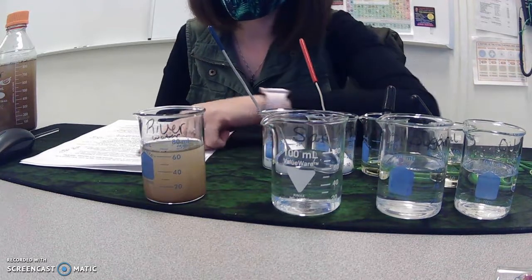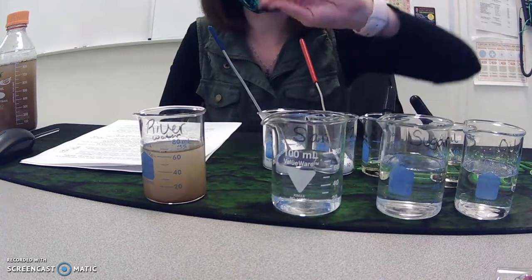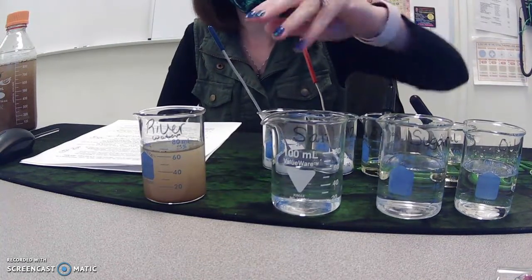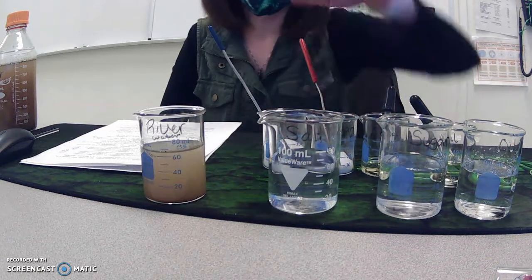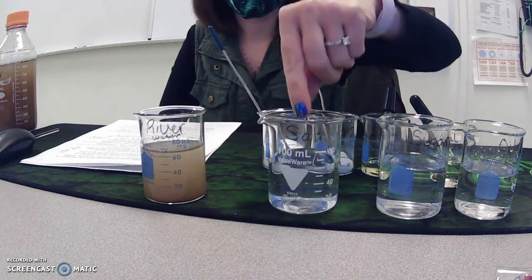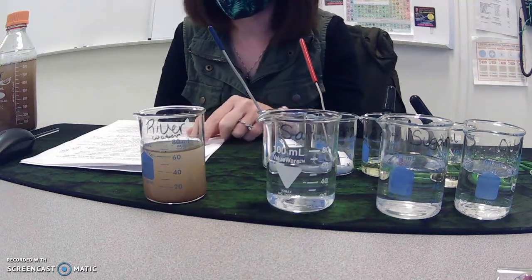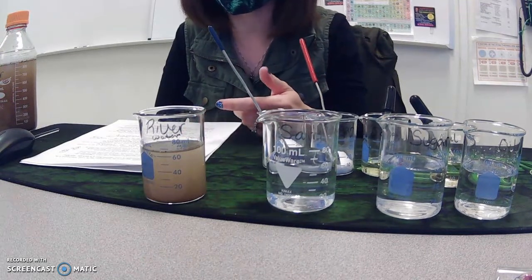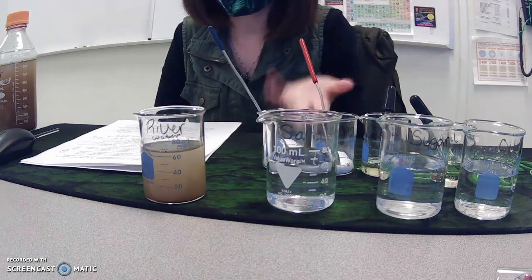When a soluble ionic compound is combined with water, it dissociates into its ions. The sodium ion becomes +1 and chloride becomes -1 inside the H2O in this container. Because of the separation of charges, solutions with dissolved ionic compounds are electrolytes.